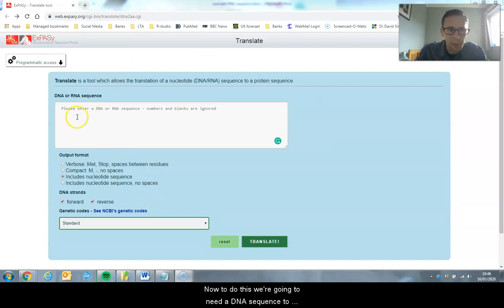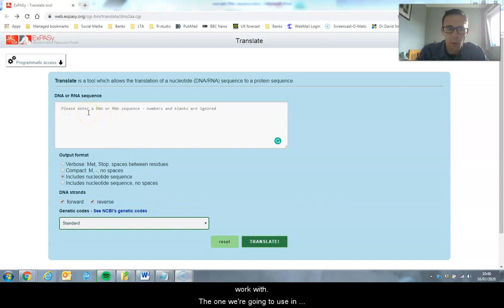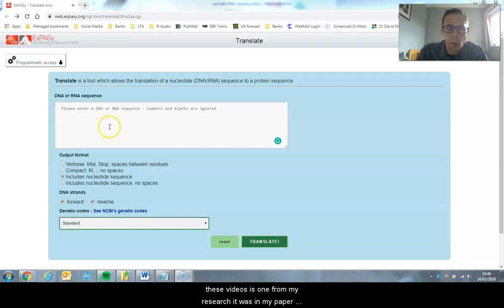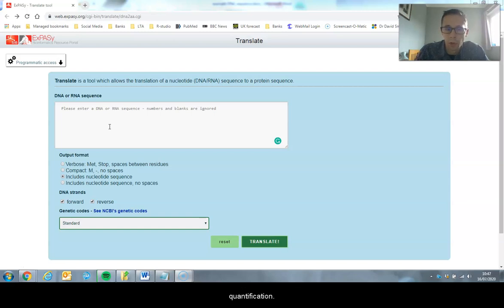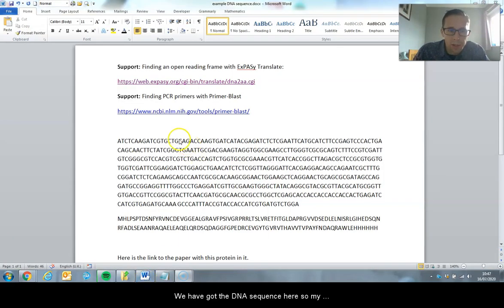To do this, we need a DNA sequence to work with. The one we're using is from my research - a paper where we created a protein for use in mass spectrometry quantification. We've got the DNA sequence here.